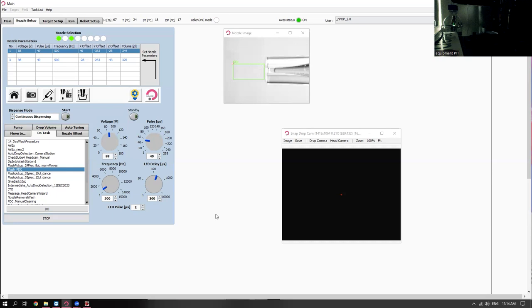how to organize that. We had a group ask for randomization of TMT labels in a different prep the other day. It was something that was really easy to do because you want some variability in the confirming that there aren't just bad things with your labeling and whatnot. So, I think that's the right way we should be thinking, right?